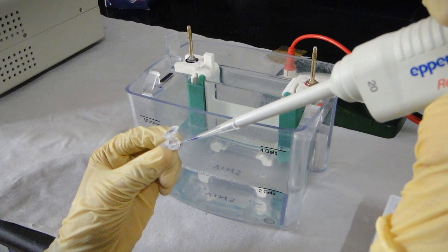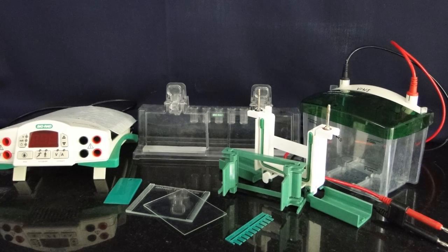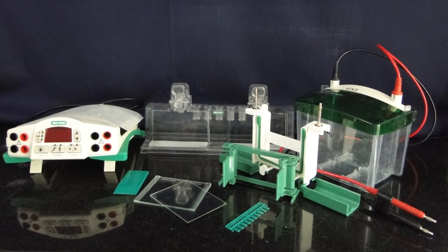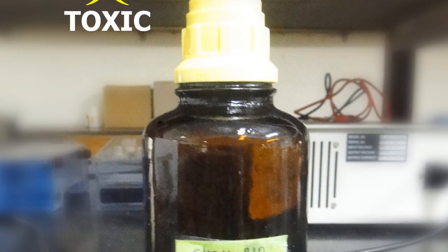Caution! Wear gloves at all times while performing SDS-PAGE. To ensure proper alignment and casting, the glass plates, spacers, combs, and casting stand gaskets must be clean and dry. Pay special attention while using acrylamide as it is a neurotoxin.